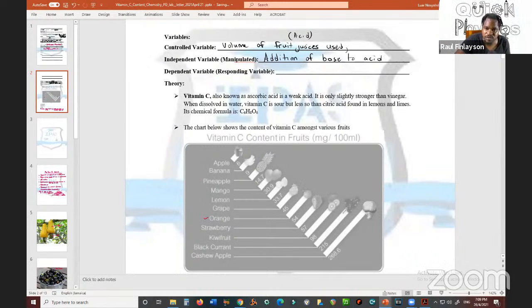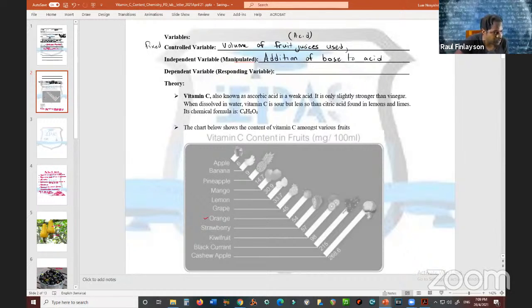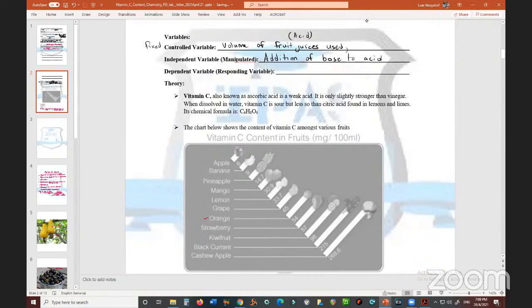So the first variable, the control, is fixed. We're not going to trouble that. In fact, we set it one time and left it. Everybody get that? Yes, sir. All right. So let's put an example. Let's say 20 centimeter cube.